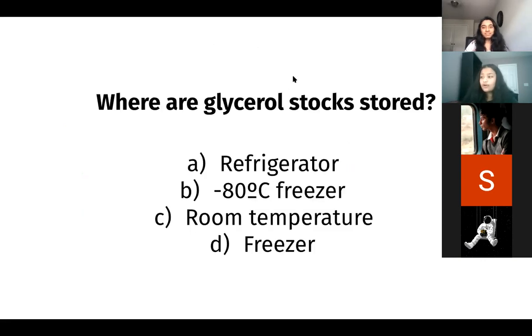Okay, so another question, where are glycerol stocks stored? I just went over this, so you should know the answer. There are 4 possible answers: refrigerator, negative 80 degrees Celsius freezer, room temperature, or just a regular freezer. So just put your answers in the chat.